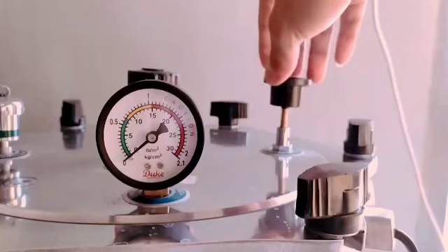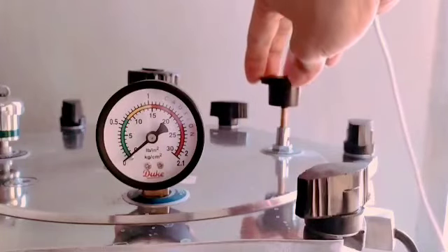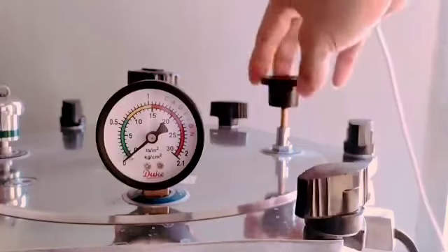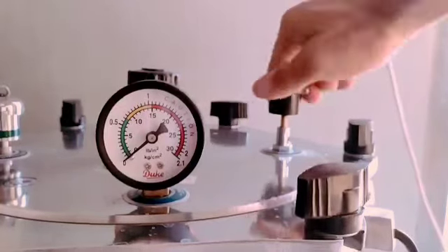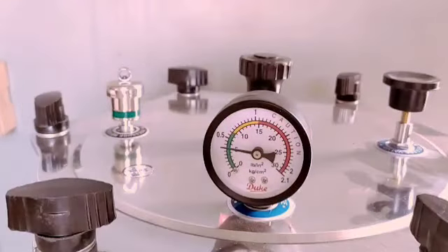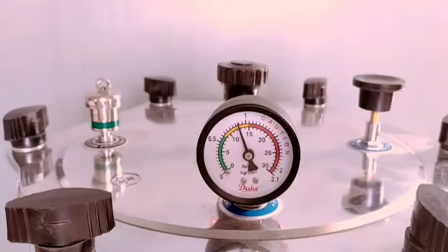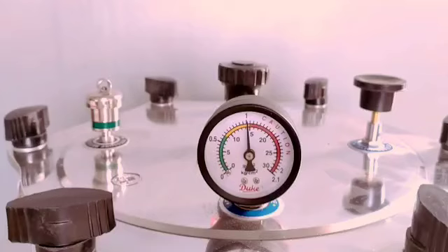Once the pressure reading is back to 0, close the air exhaust valve tight to allow the pressure to gradually increase again. Depending on the size and capacity of the autoclave, it can take anywhere from 15 minutes to over an hour for the pressure within the autoclave to reach 15 psi with a temperature of 121 degrees Celsius. Begin the sterilization time countdown from when the pressure gauge reading first reaches the 15 psi mark.